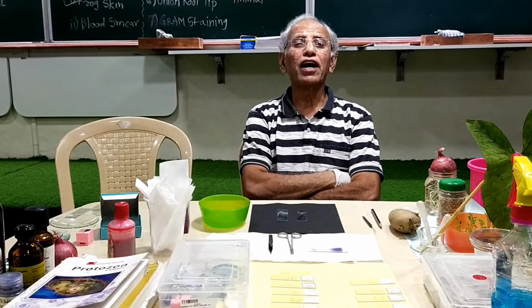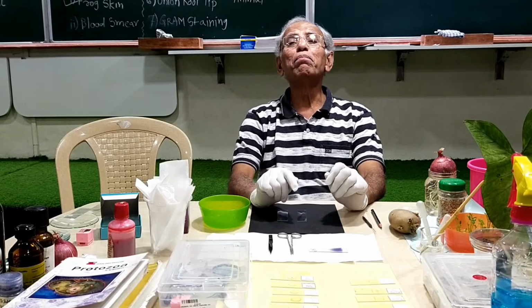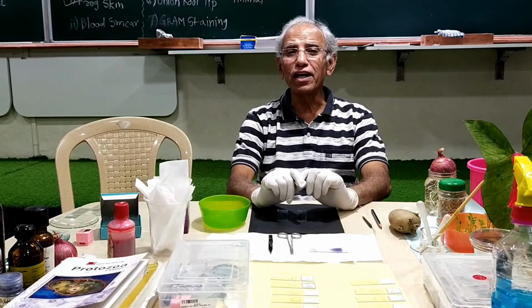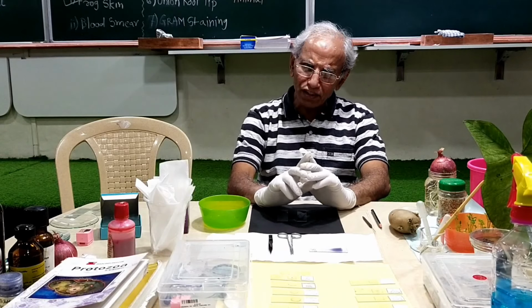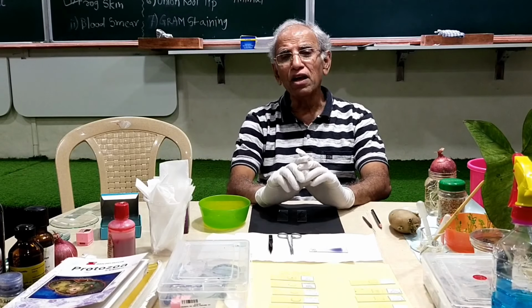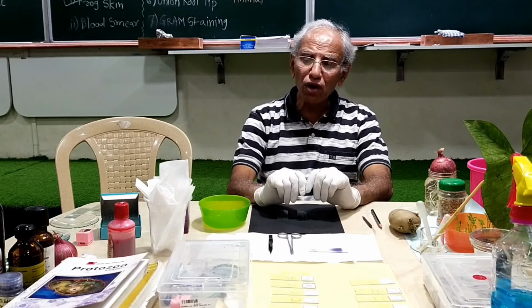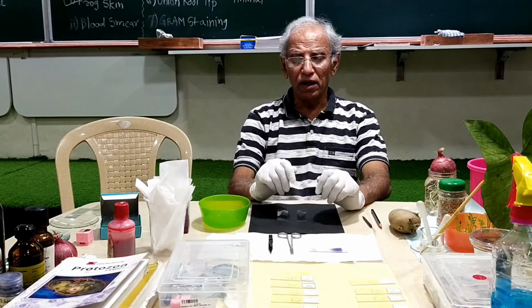So our next item for the practical demonstration is to make a blood smear to observe the red cells. White cells also can be observed, but there are certain issues which I am going to explain. I think today we will be restricting ourselves to the red cells. For that to happen, we have to prepare a smear.